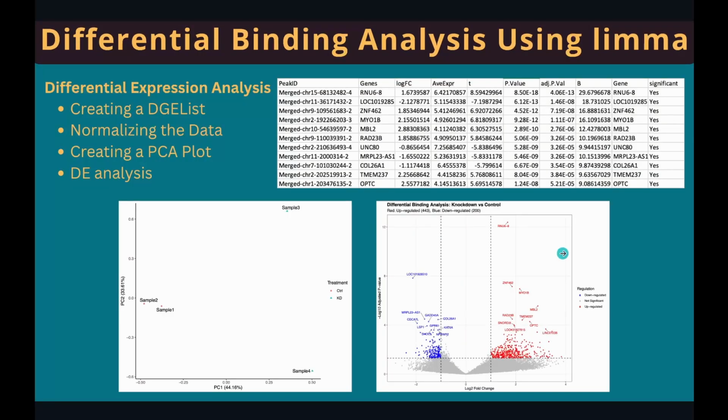Once data formatting is done, we can perform differential binding analysis using limma. The process is exactly the same as differential expression analysis as we covered before, so I'm not going to repeat it. You can find all the code on my website ngs101.com. The results are in the same format.